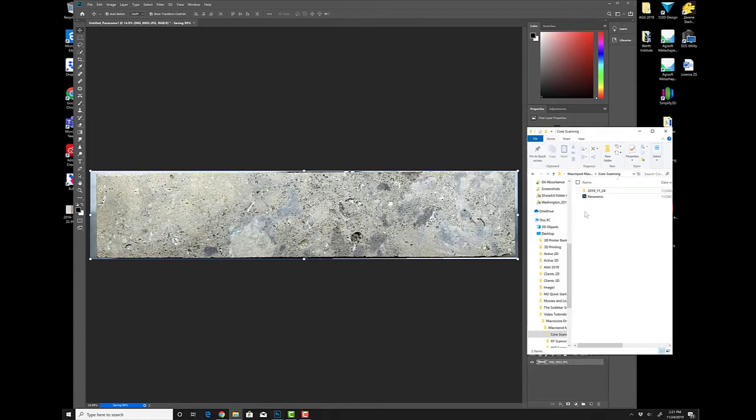And that is basically a step-by-step process on how to capture a panoramic photograph of your core sample. So please stay tuned for the next XY scanning video, and then we'll talk about how to integrate focus stacking with this type of work as well.